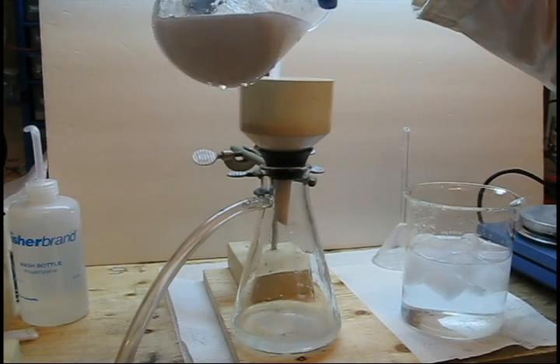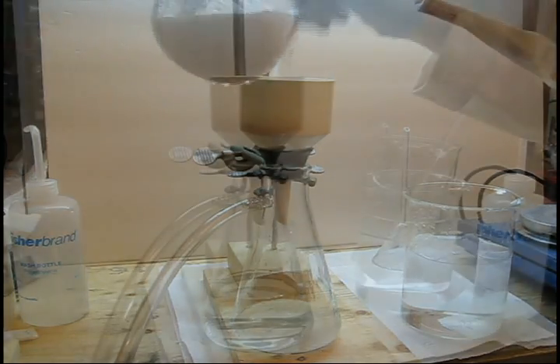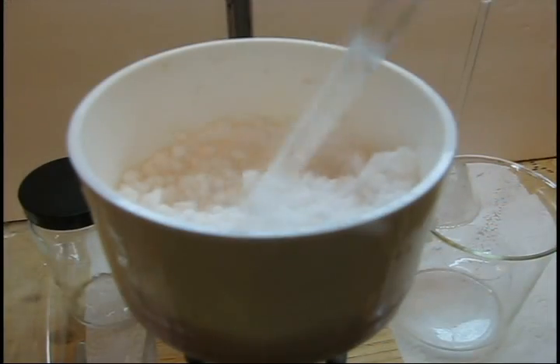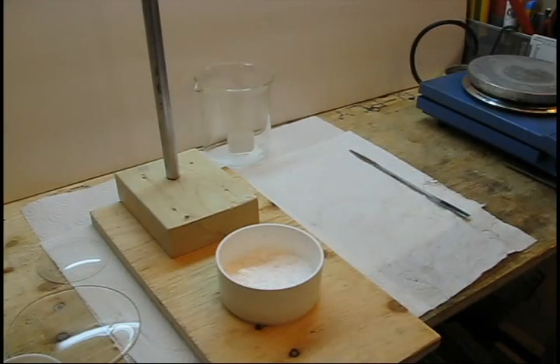Now filter the slurry by vacuum filtration until dryness, and use a spatula to break up any lumps. You will obtain a fluffy white powder that is mostly acetylsalicylic acid.